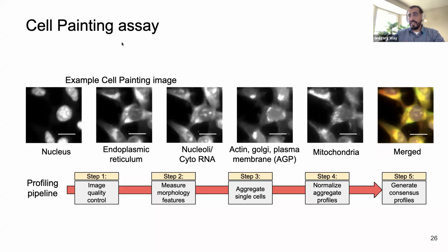I already described the cell painting assay, but just to note that we collected the cell health assay and the cell painting assay side by side, much like we did with the L1000 and the cell painting data, side by side across the same perturbations. In this case, they were CRISPR perturbations, but that's not really important for our application. The goal is to use the cell painting data as essentially an unbiased readout of cell state to predict the specific targeted reagents of the cell health assay. Also to note, we used CellProfiler data in this particular example.